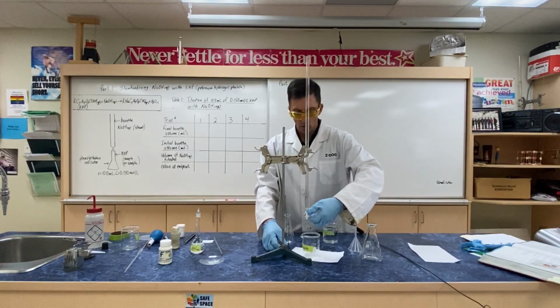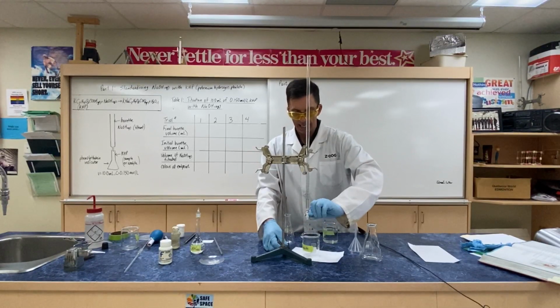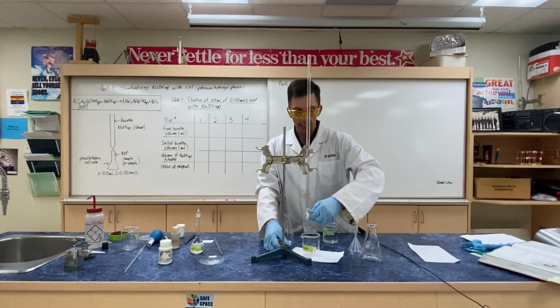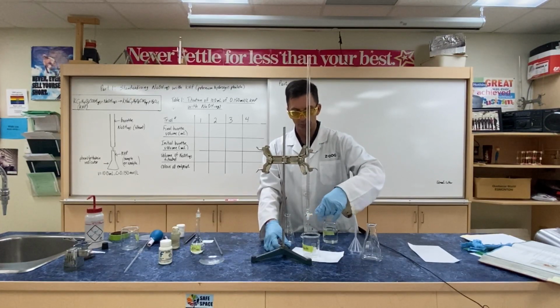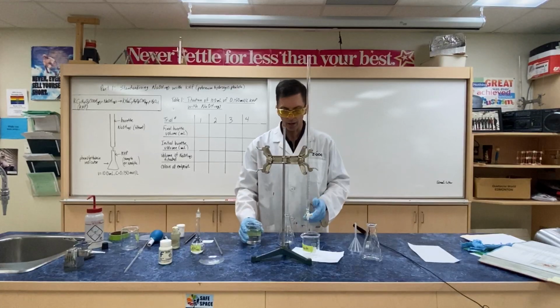Why wouldn't we just rinse with distilled water? Again, we want to coat all the surfaces of our glassware with our titrant, or sodium hydroxide. We don't want any dilution or any chance of contamination. You also want to make sure the valve at the bottom works, because some of them don't. That's right. Make sure your stopcock's not clogged.